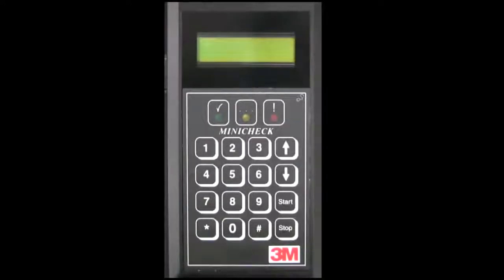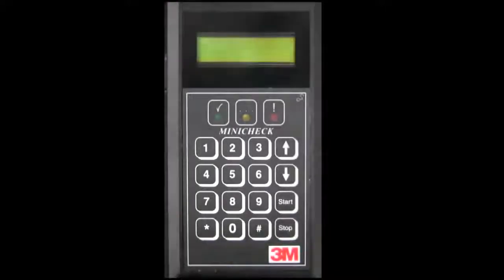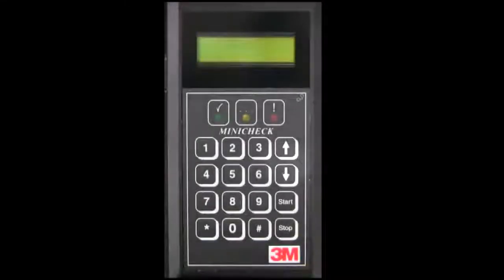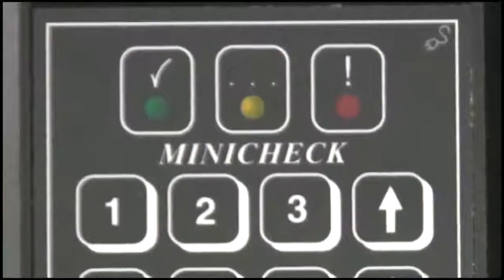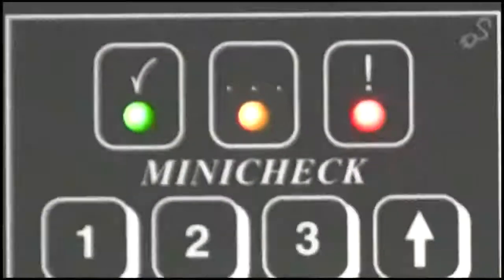Physical features consist of a keypad to enter numeric values as required to execute testing, a start and stop button, and an up and down arrow to begin and end testing and navigate through menu choices. Just above the keypad are a series of indicator lights that identify the status of the device: green to indicate an acceptable test result, yellow to indicate the device is busy, and red to indicate a failed test result or an indication for the user to proceed.